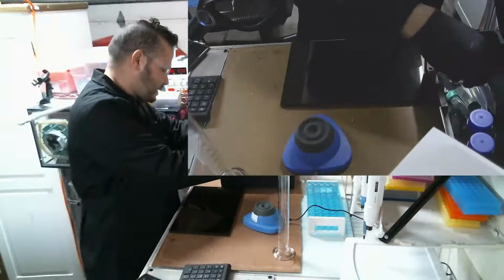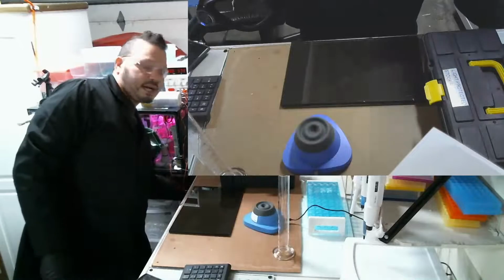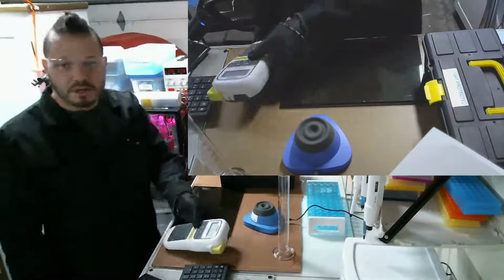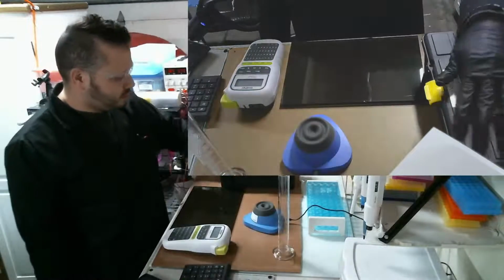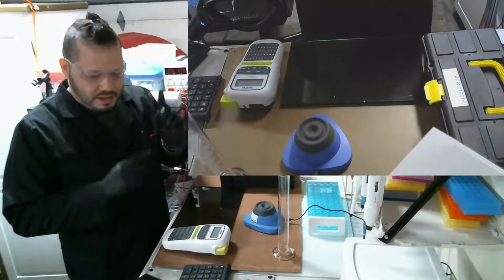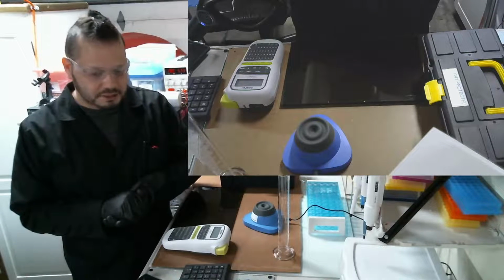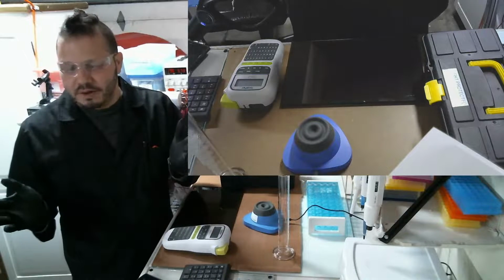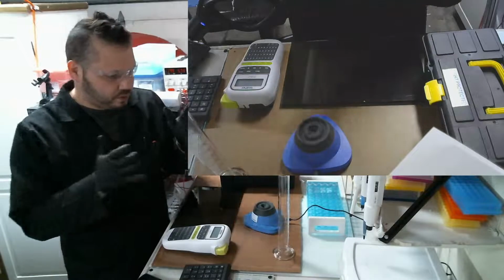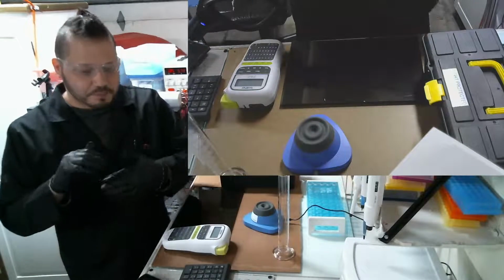Then I'm going to put this in here for now, because I need to print out a label and label it, but I don't want it to sit out in the light for too long. I'll do that after. And anyways, that's how to calculate the dilution factor when you're going from one solution concentration to another.